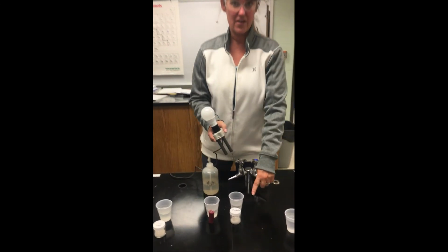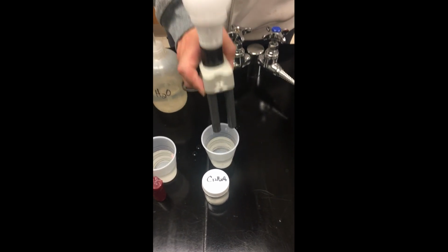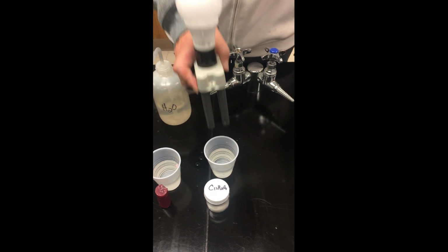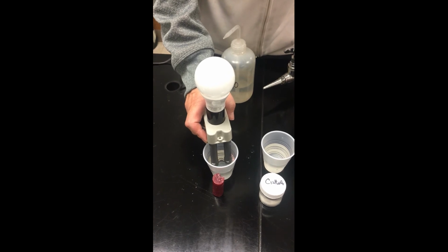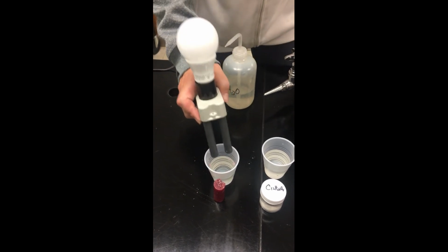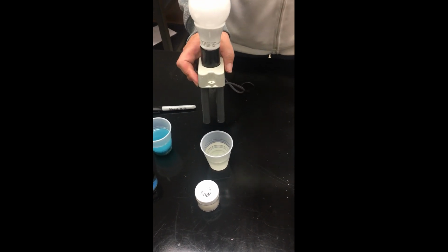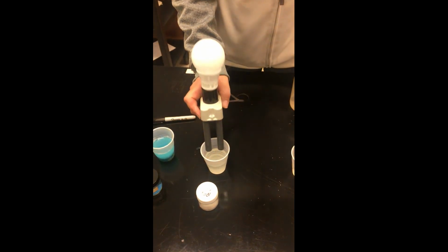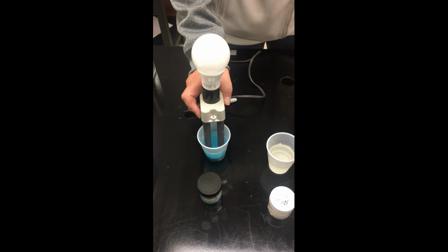So let's see what we have. First, we have our sugar water, and we have no light. So no current there, no charged particles in the water. Then we have our candle wax. Again, no light, so no charged particles dissolved. Our salt, which was my example, should break apart into charged particles and connect the current, and we got some light there. Okay, and our next sample was copper sulfate, and we'll see if this makes charged particles, if it's ionic. We got some light there too.